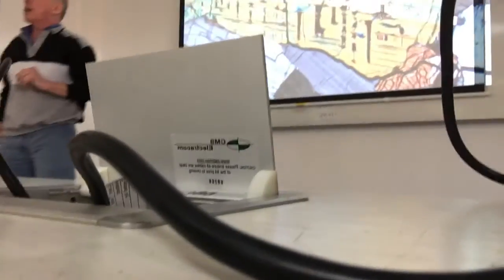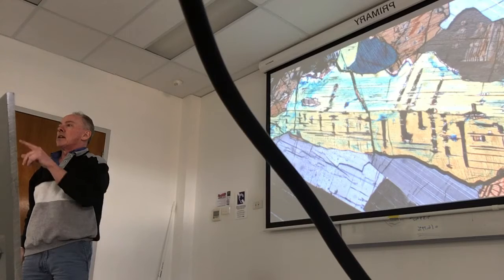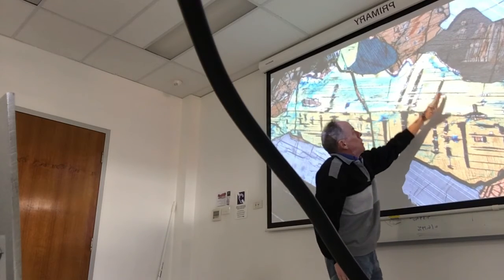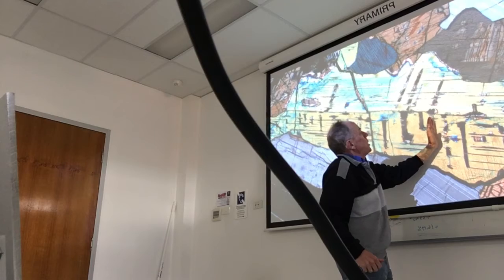It resembles the spine of a fish, and these are the ribs going off at a different angle on either side. Why are they going off at a different angle on either side? Why have they changed orientation? Yeah, it's because that's a twin plane. Remember I said these things will exsolve along a plane of weakness, so that'll be one of the cleavage orientations.